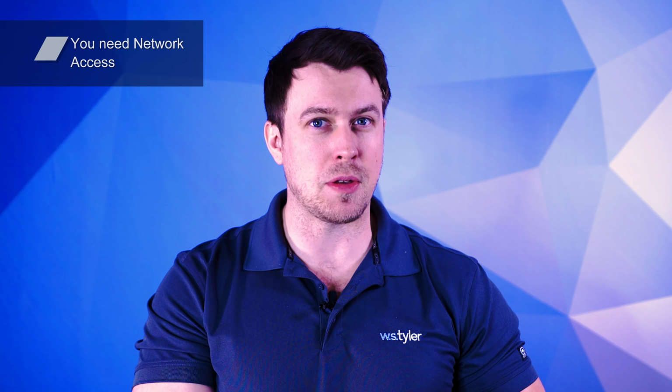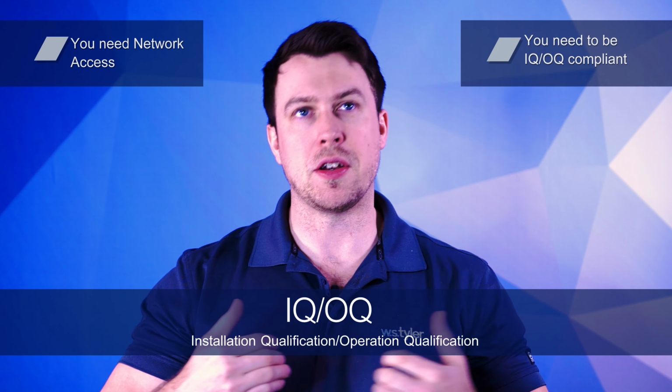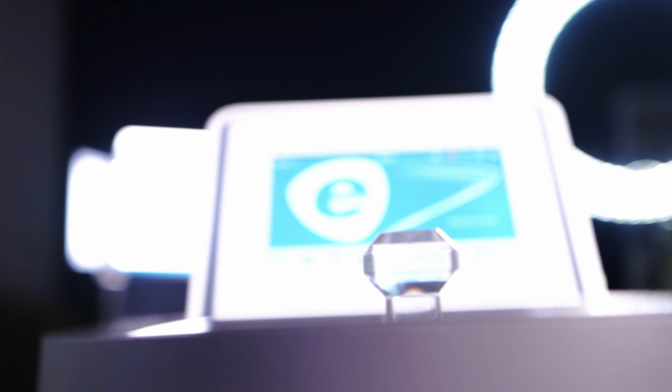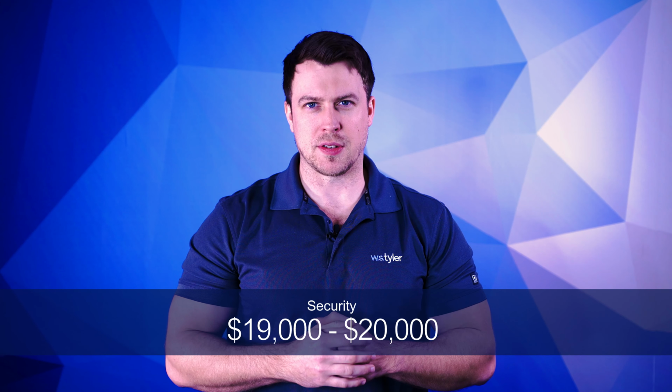There's a couple things that you need if you're going to have a Security. You need to have network access because everything has to be backlogged and audit trailed. You need to complete some kind of IQ/OQ, or installation qualification, operation qualification. We will go on site with the lab operator, with whoever needs to be there, and we will run through that entire IQ/OQ list, sign everything off, date everything, and it'll all be initialed and signed by whoever's installing and performing the IQ/OQ and whoever's operating the lab. The Security costs between $19,000 and $20,000.